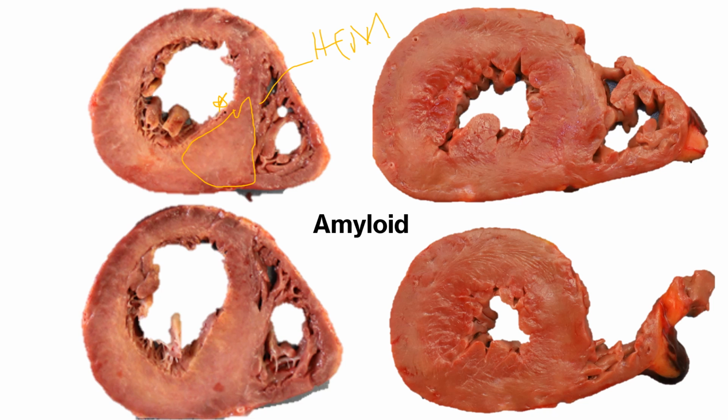So in this amyloid heart, this has to be a good textural feeling because the myocardium itself will feel much firmer, right? It's getting amyloid deposition, changing the texture and the structure of the heart. But compared to a nice normal brown, you're getting a yellow, tanny, pinky kind of discoloration. But that's not always exclusive.